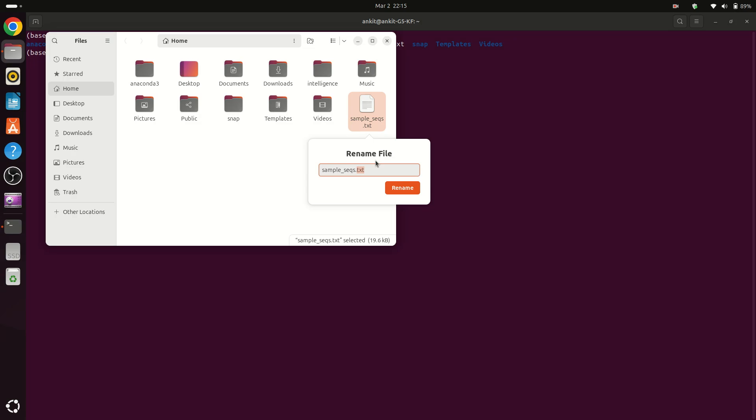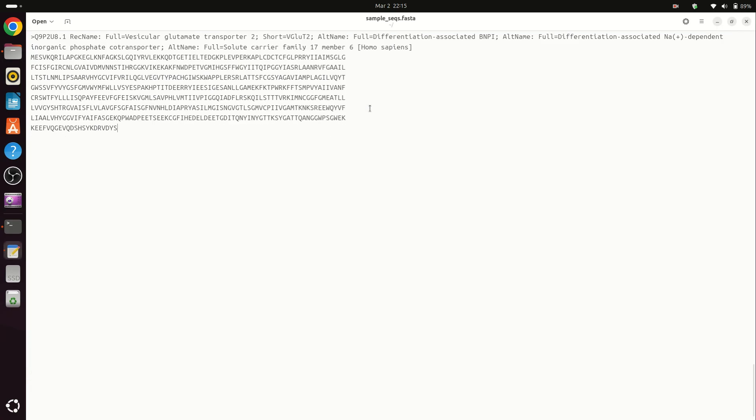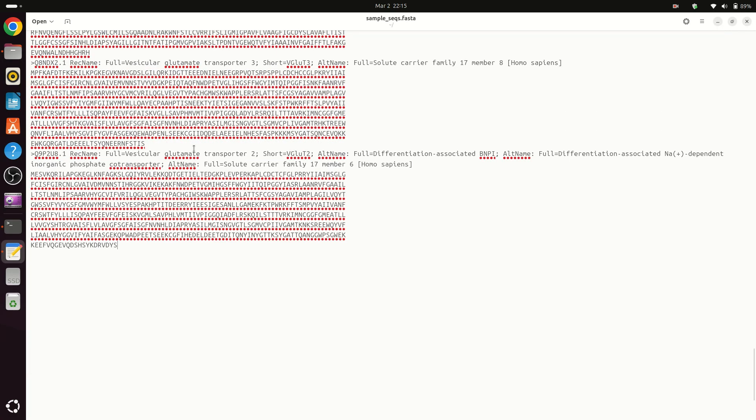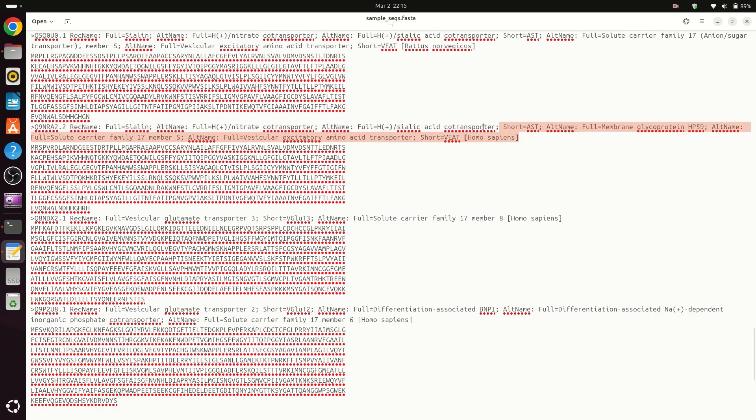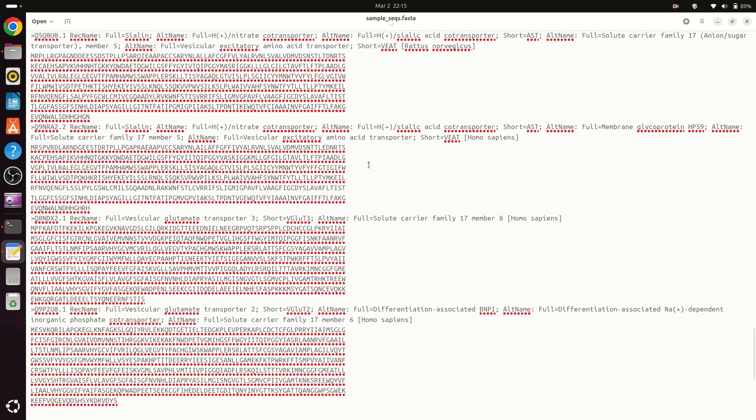So I am changing this to FASTA. Whenever you have FASTA sequences, this file looks like this: first we have a header and then we have a sequence. So there are multiple FASTA sequences.